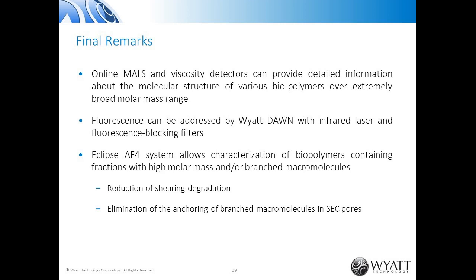This next question is a little bit long, so I'll read it to you, and you can ask me to repeat any of it if needed. I'm familiar with a recent publication in which you are a co-author about absolute molecular weight characterization of lignin using SEC-MALS. One question I have about it is why RI is used for lignin as the concentration detector, given that UV absorbance at 280 nanometers generally gives a much stronger signal. Is there a benefit to using RI over UV in this case?